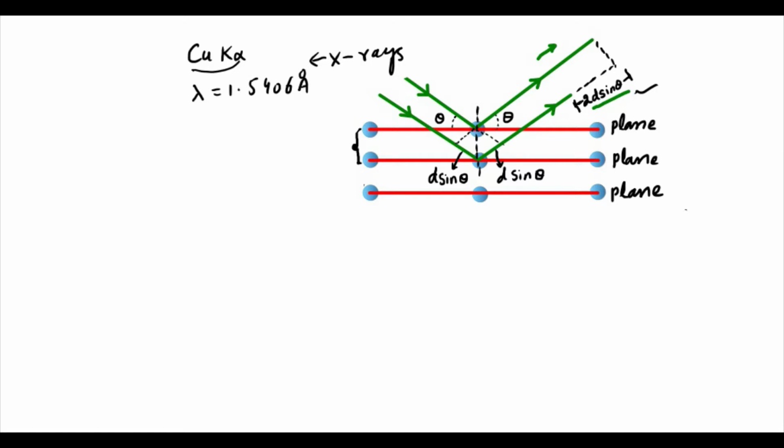And here we have, for example, the atoms arrangement. So these are called the planes, and in the Miller indices this one is 100, and here is another plane. The distance between these two planes is called the interplanar distance, or d spacing.